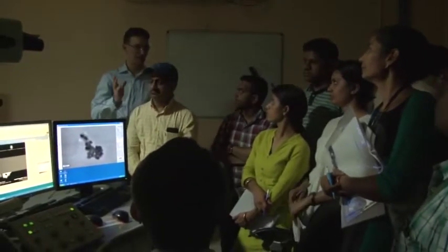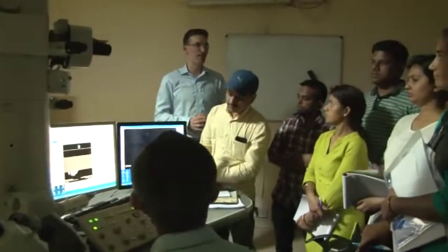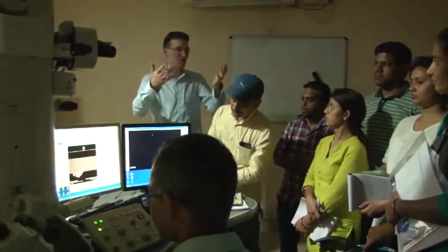For every magnification, as a pixel size, and your sampling of one atomic column, you need 3, 4, 5 pixels, and it doesn't make sense to go even further because you don't gain any more information. You don't enhance resolution by going even further up. The maximum value is above what you need for atomic resolution imaging, but then you just limit your field of view.